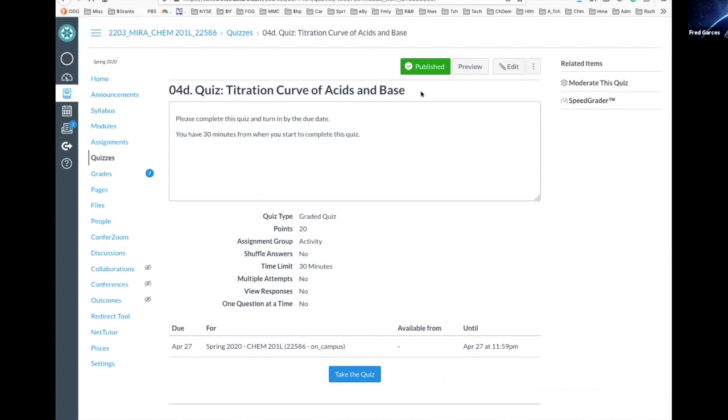I click on that. You're going to basically tell me what your unknown is, what the molar mass of your unknown is, and what the pKa of your unknown is. And I'll give you top choice and second choice if things are close. So you can turn in 2 choices of what your unknown is. Your top choice will get full credit if you get it right. Your second choice, you probably get 25% off. But it's at least better than getting 0 if you guess wrong in your first choice.